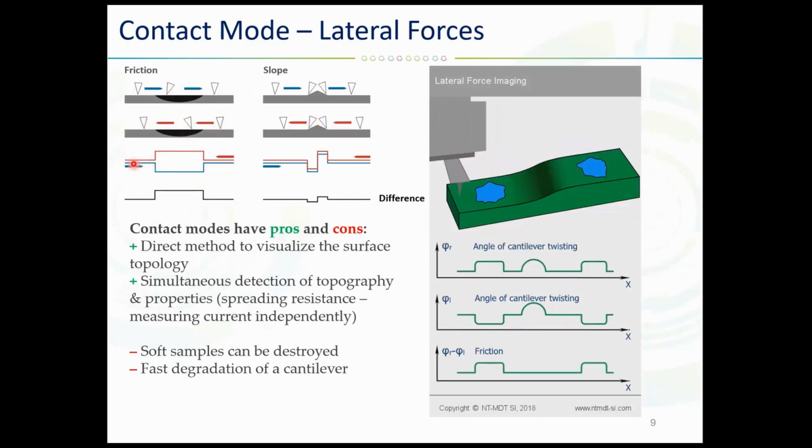So when you check the curves, they might have slightly different features, and usually when you superimpose all of them, you can get what is actually happening here and below, the difference. What you're interested in is not the sign of the curve, plus or minus, but the difference that occurs between different features of the sample.